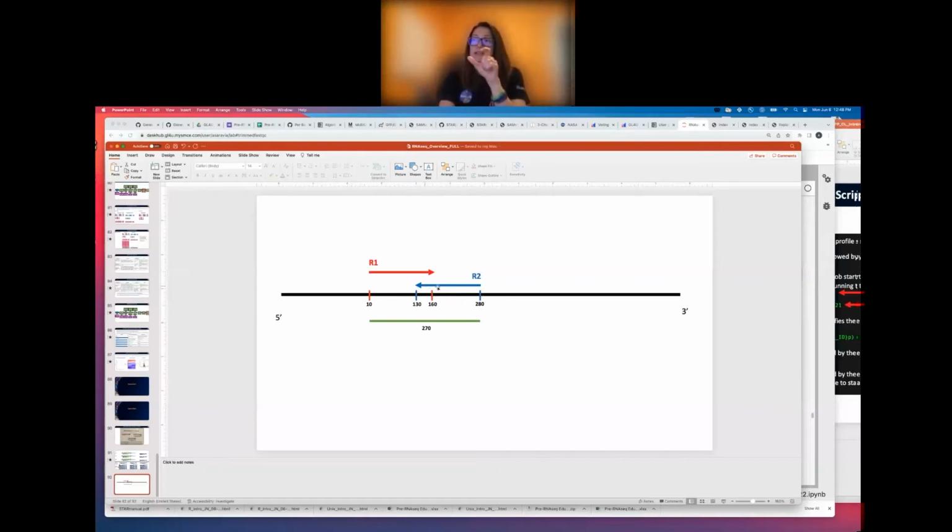So what it does is it aligns it in the reverse complement, actually. That's why these are pointing in different ways. And then it says, okay, the leftmost position of R1 here is going to be the start of my template length, and the end of my template length is going to be the end of R2 when it's mapping in the reverse complement orientation of its respective mate pair.